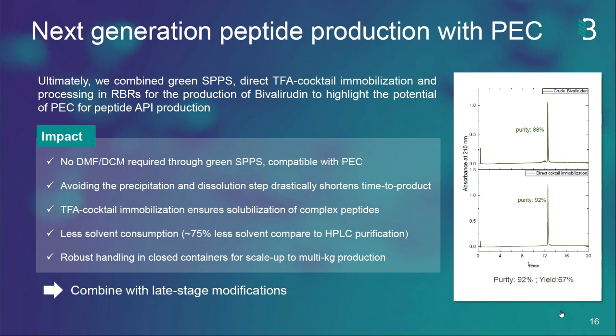Okay, then is the SpinChem RBR suitable for solid phase peptide synthesis? Yeah, those are suitable, but in our hands we didn't try. According to the chemistry, as SPPS is compatible and SpinChem is compatible with the organic solvents and chemicals, we hope that it's possible, but we have to try. We are open for customer projects as well.